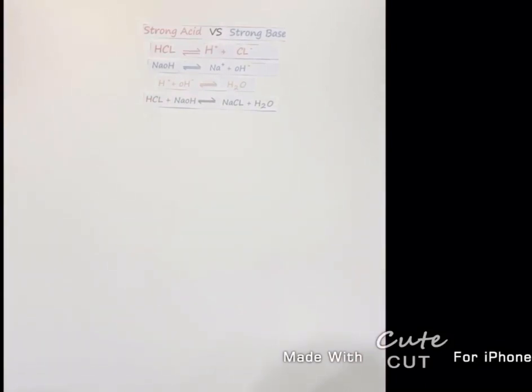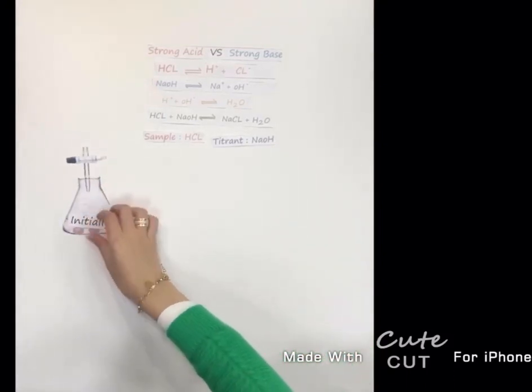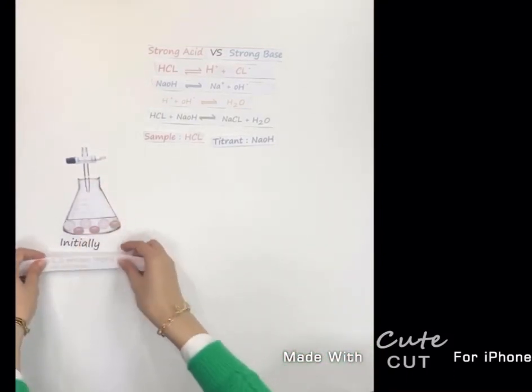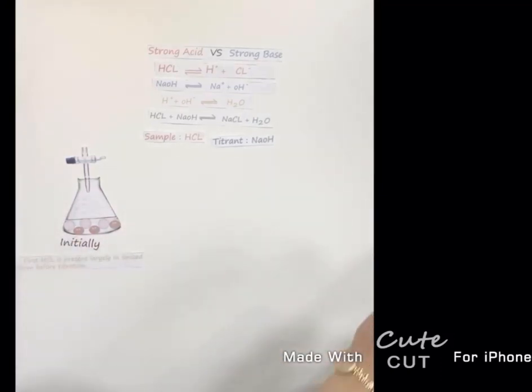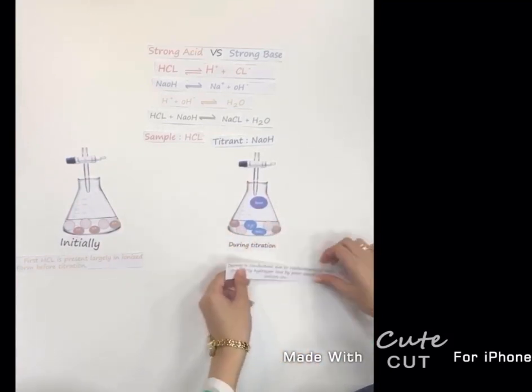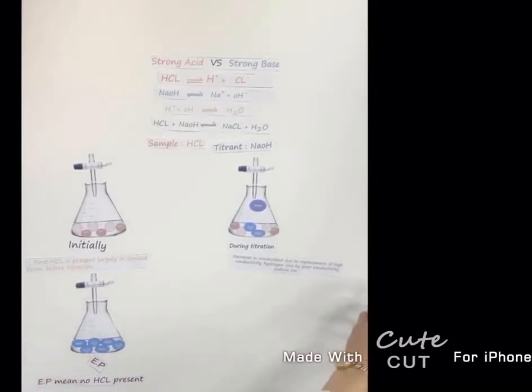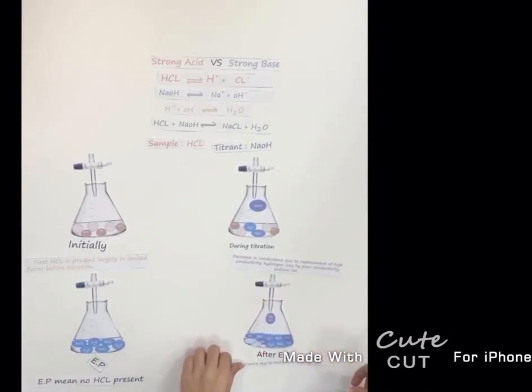The sample that we will use is hydrochloric acid, and the titrant will be sodium hydroxide. Before titration, hydrochloric acid will be found in large amount in ionized form. During titration, a decrease in conductance will be observed due to replacement of high conductivity hydrogen ions by sodium ions. At the end point, no hydrogen ions are present. After the end point, conductance will increase due to excess free hydroxyl ions. And this is the curve of the reaction.